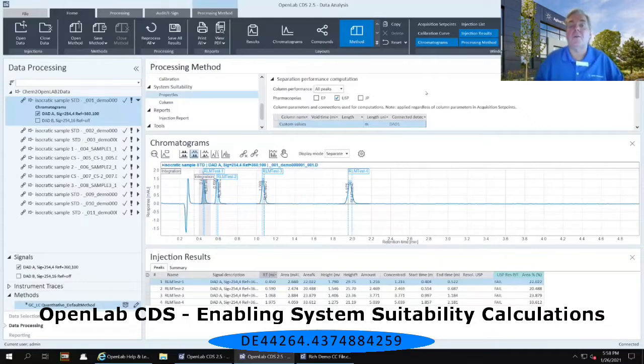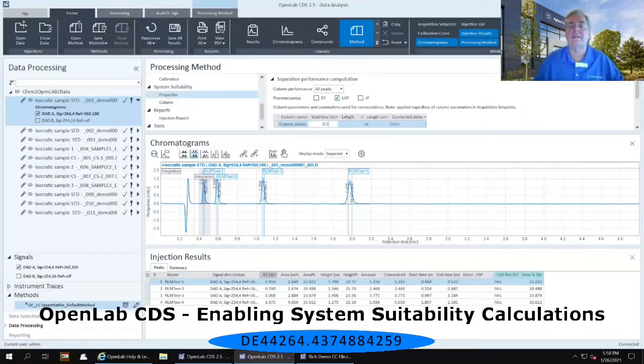For the void time, we're going to put the void time in as 0.1 minutes. And the length, we're going to put as 0.1 meters.